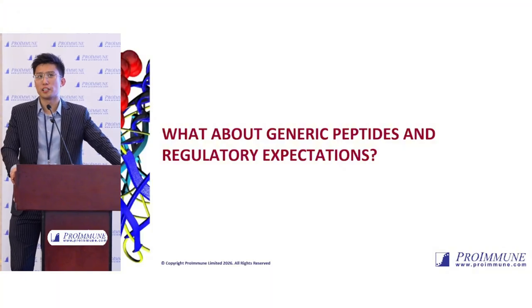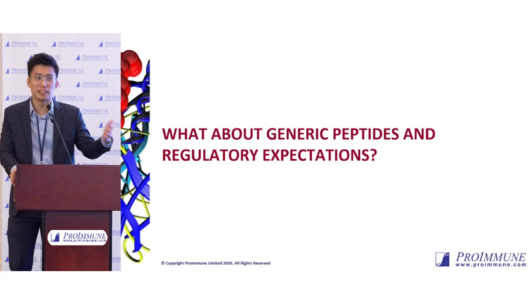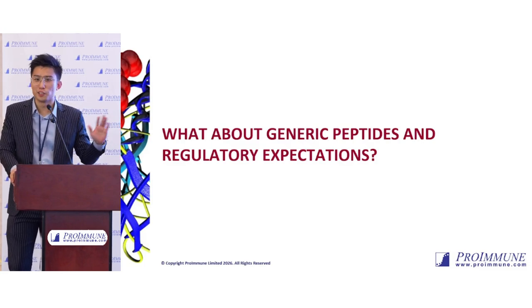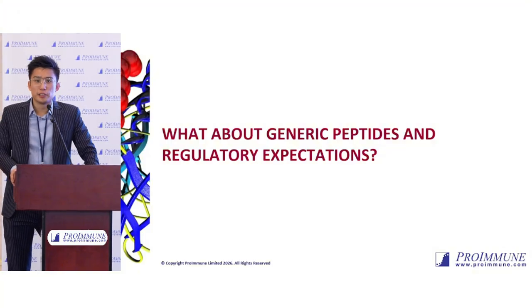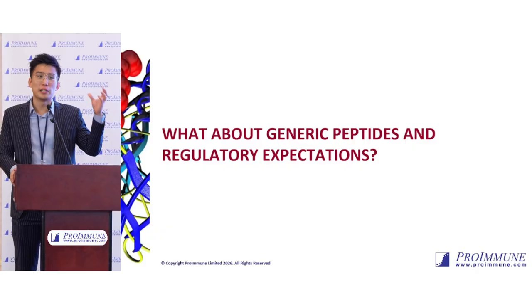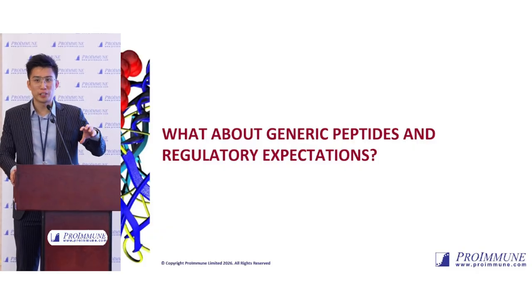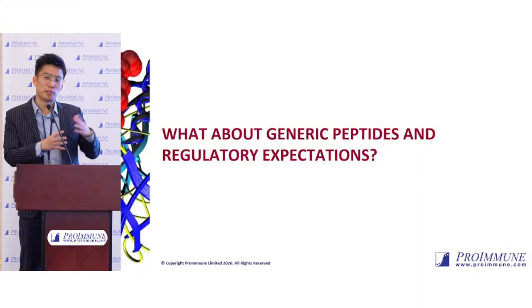What if your assay is just not sensitive enough to pick up any of these innate immune triggers? Because if it's an insensitive assay, whatever you test is going to be 0 anyway. So then the question is, how can we capture this? That's where we start to think about what are the suitable IIRMIs that can be included in the assay to demonstrate that sensitivity.